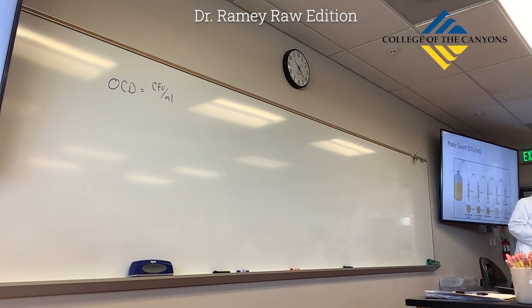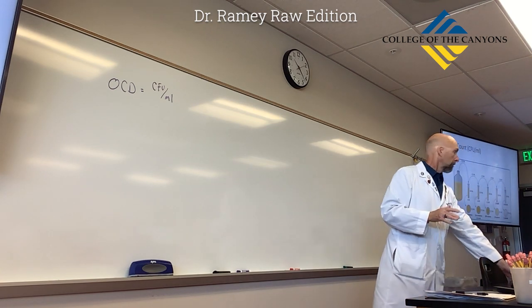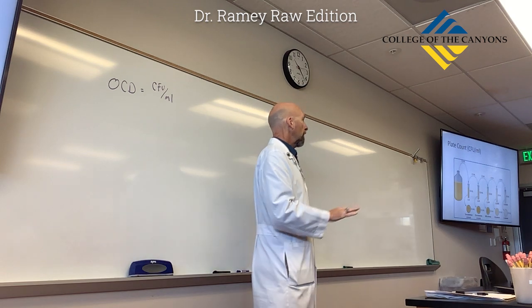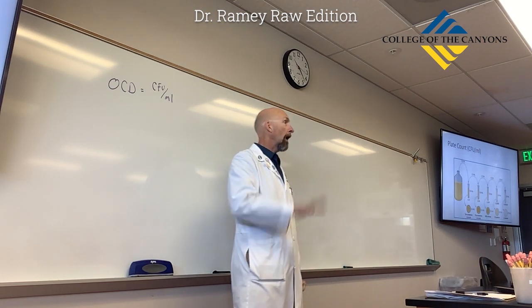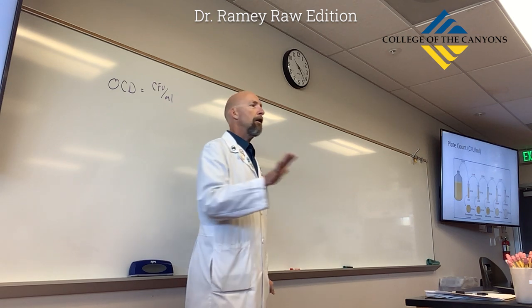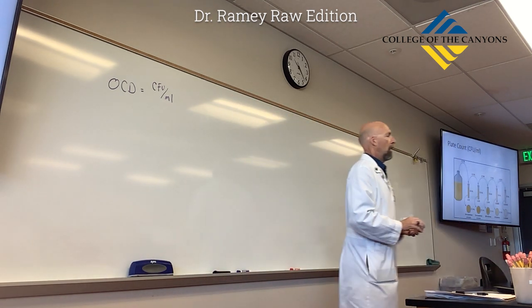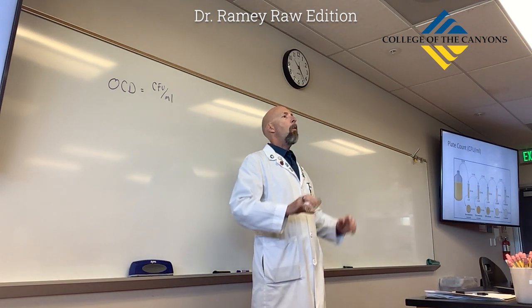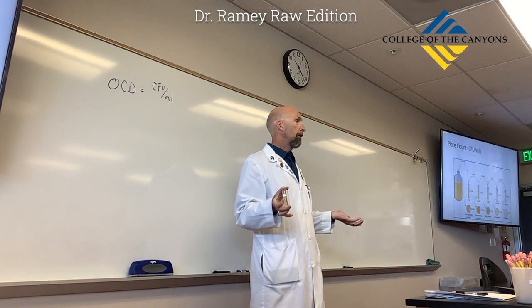Okay. Well, you're gonna find out, right? Okay, listen. You're gonna find out because you're going to perform this experiment and you are going to count them and calculate. Here's the problem with the scenario I just described. The number of bacteria per mil in those cultures is way too high. If it were actually 50, what I just described could work.